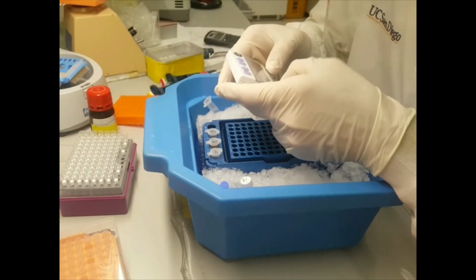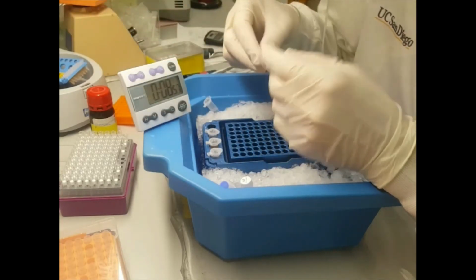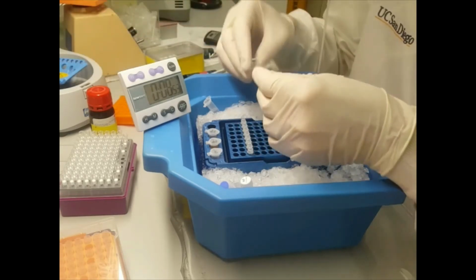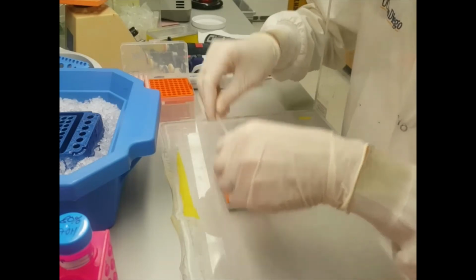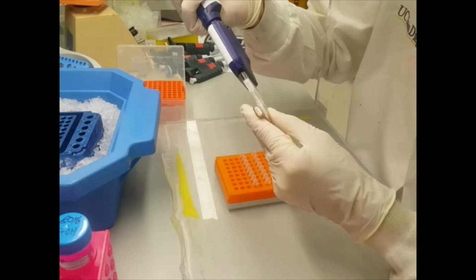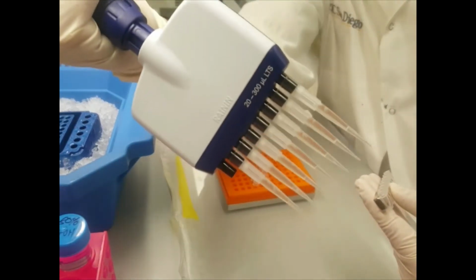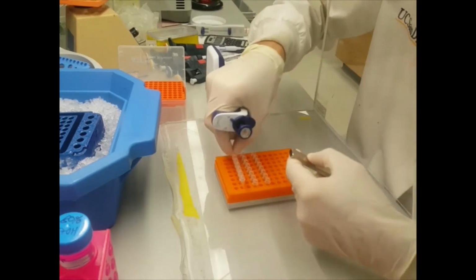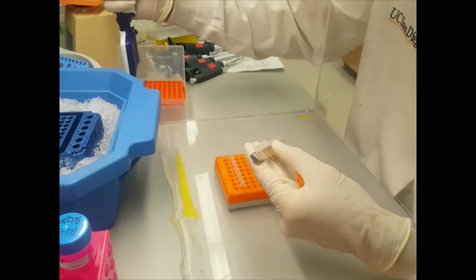Under these conditions, RNAs with sizes larger than about 10 nucleotides precipitate to the beads. Following this 10-minute incubation on ice, collect the beads on a magnet for 3 to 5 minutes. Make sure the liquid is nice and clear and all beads are carefully collected at the magnet. Do not aspirate the liquid, as it contains spike-in. Instead use a pipette.